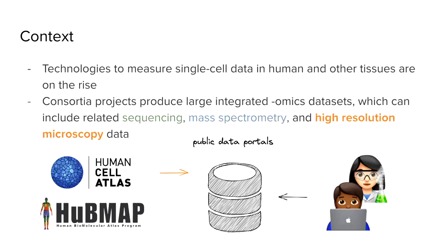As I mentioned, today I'm going to talk about one very specific aspect of this work, which was focusing on high-resolution microscopy data, a project that spun out in order to support that high-resolution microscopy data within HuBMAP, and then also the development of cloud-based imaging formats and open standards.